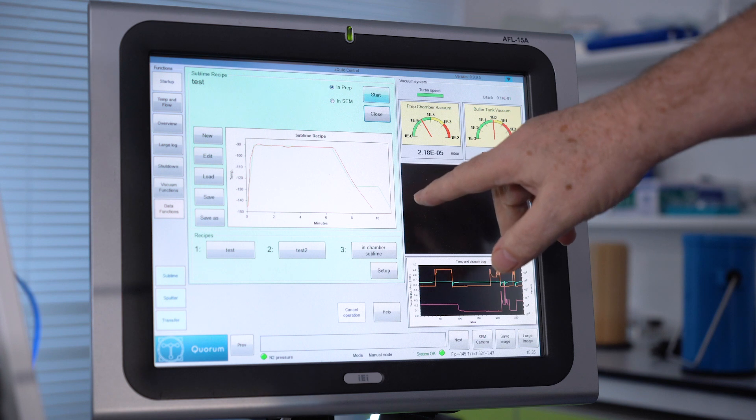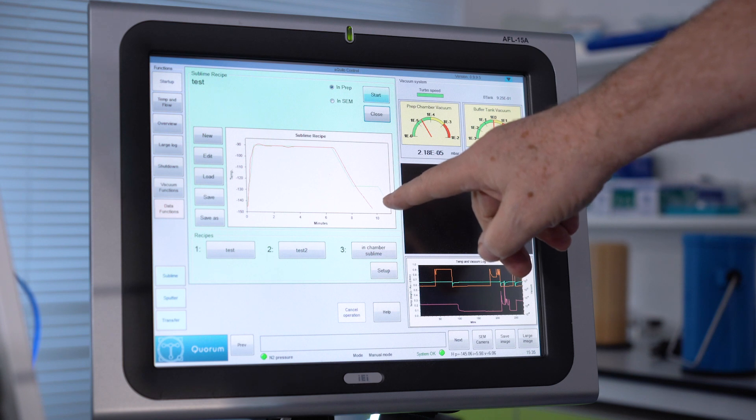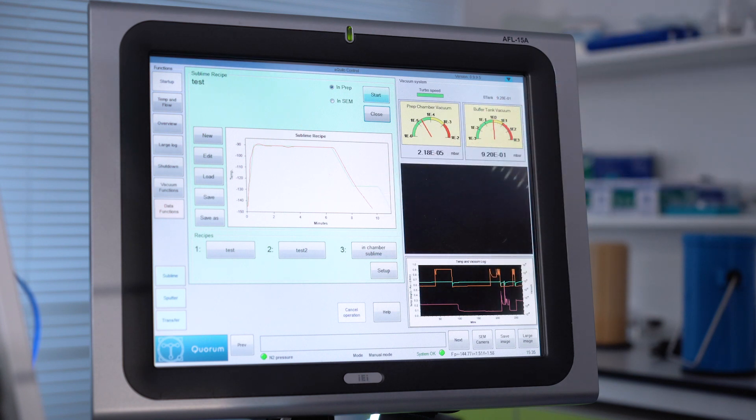All this curve can be saved and then used later in the report. And now that we've finished the sublimation, you can see the temperatures come back down to normal. We can then go on to coat the sample if we want to.